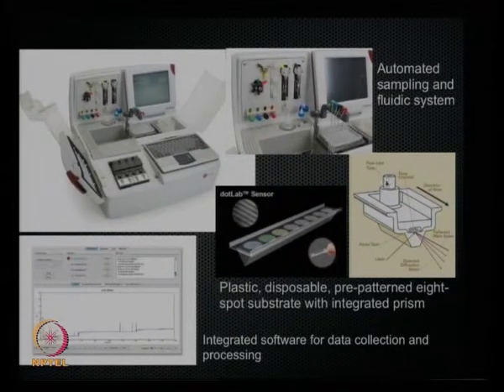There's an insertion port, the injection port where you inject the analytes, and it just goes to that little channel, which is about 20 microliters or less. But it has a pumping system, so you can actually control the flow rate and so on, which becomes important when you're doing kinetic studies.